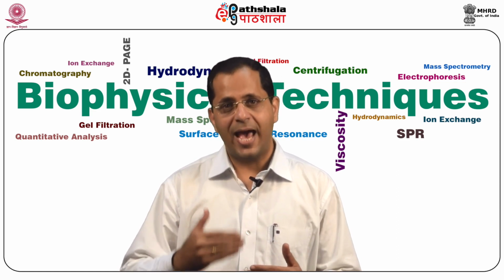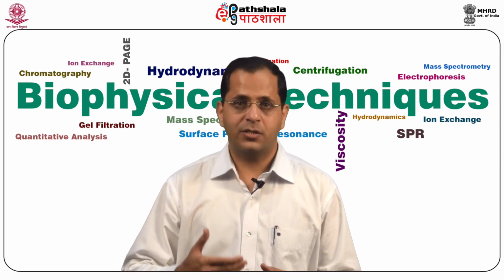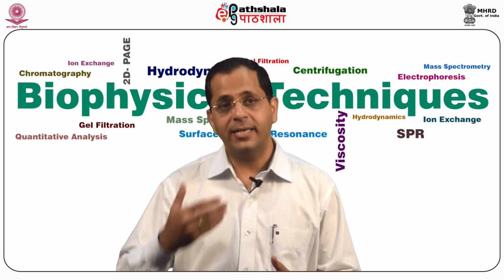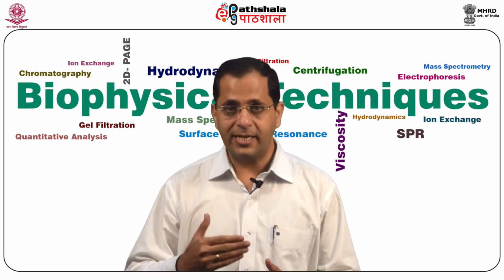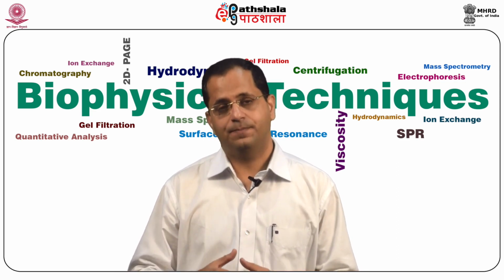Pre-fractionation uses an array of chemical reagents or antibodies, peptide libraries, chromatography, and electrophoresis methods to enrich the proteins of interest and deplete unwanted proteins, thereby increasing the signal-to-noise ratio in 2D electrophoresis. The technique of pre-fractionation depends on the experiment and the required outcomes.